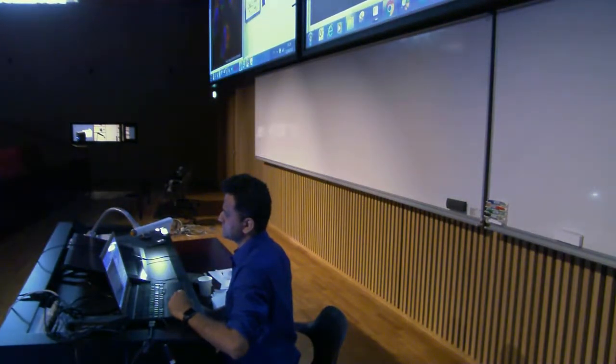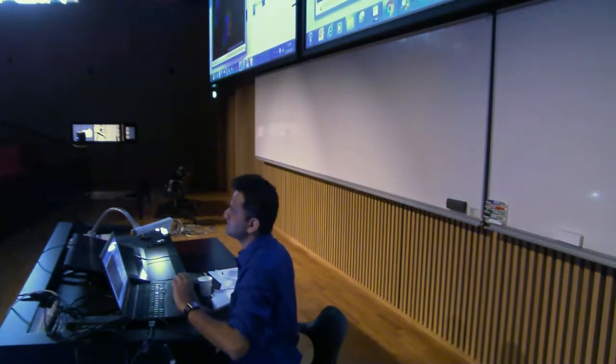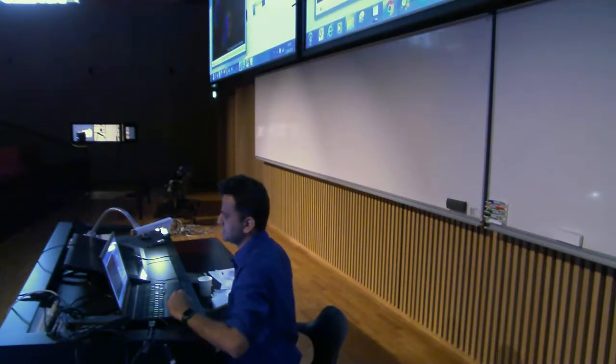This is how you can change settings. And please remember, this is what I was talking about, why you should be in composite mode, because then you can control different channels just by changing this slider. You see here this histogram is changing, so you don't have to do it explicitly for 3 channels separately. So we are in channel number 1, which is the red channel. You can change the settings.